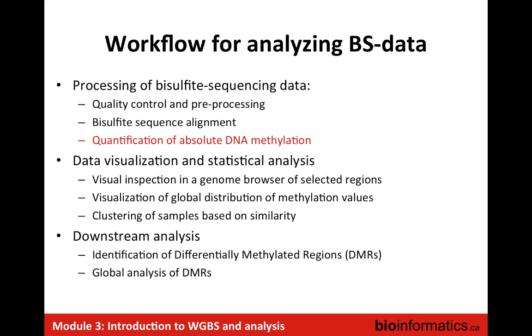Getting gradually into the fun side of things, which is the actual quantification. I said the alignment was one of the steps that is quite particular for bisulfite sequencing compared to ChIP-seq or variant calling, where your reads match the reference, so you're just mapping them to the reference. Because of the bisulfite treatment here, the alignment was a bit weird. So after that, we want to quantify the methylation based on the alignment.